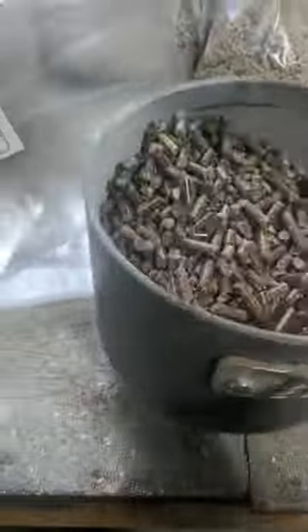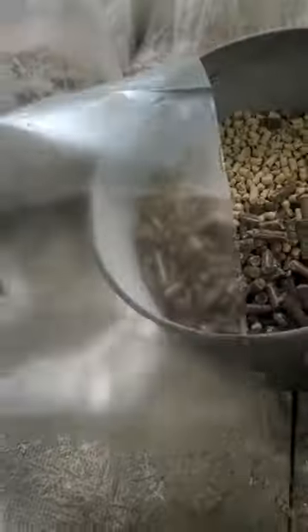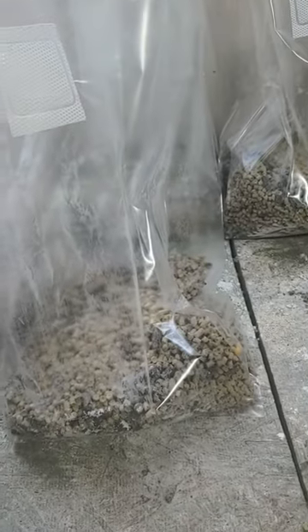Shake it up just a little bit so it's more homogeneous in the bag, and then pour it in.